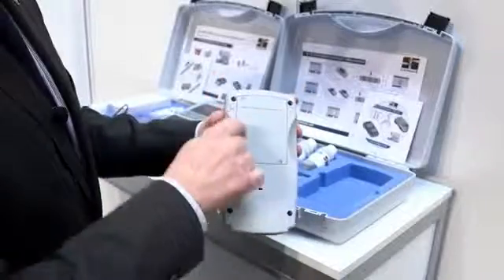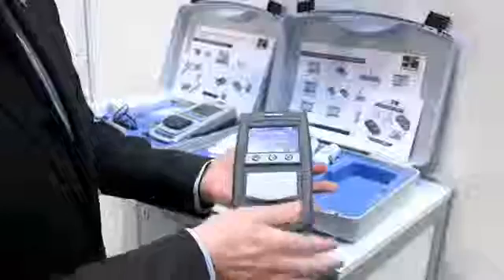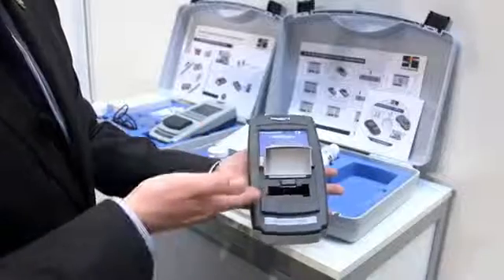It's a battery-powered unit at the back with a nice clear sample chamber. What I have here is an ASTM unit. We'll have four units initially: one to measure Gardner colour scale, one to measure platinum cobalt colour scale, one to measure ASTM, and one to measure Saybolt.